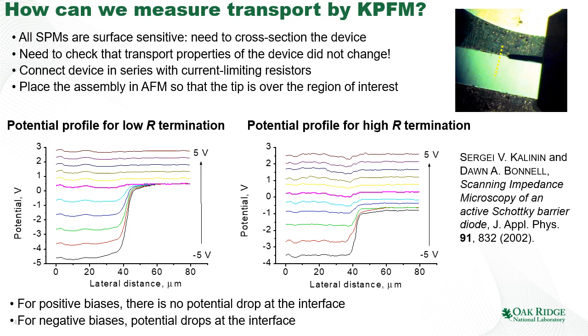It turns out that this tail is exactly the effect of the finite size of the cantilever. This is a long range interaction between the whole of the cantilever and the surface. 90% of the signal comes from the highly localized tip surface interaction, but the remaining 10% of the signal comes from the cantilever, and this is something that we can easily quantify. Notice that for a good tip, this potential drop would be dominant. For a bad tip with a damaged coating or whatever, the fraction of the information within this tail would be much higher. So this is something that tells you about both the local and non-local components in the KPFM.